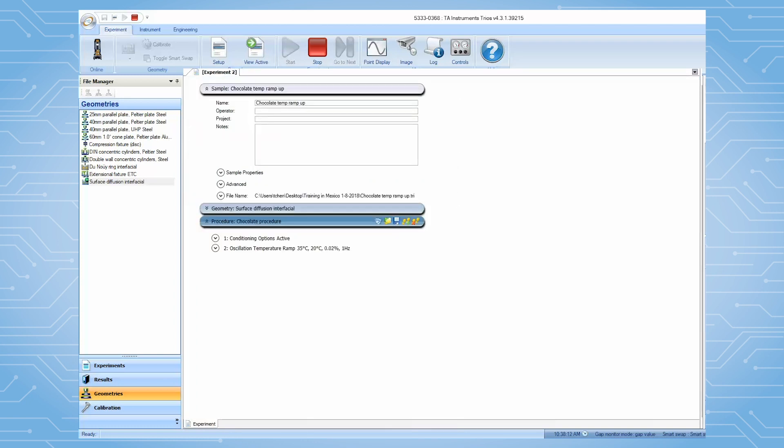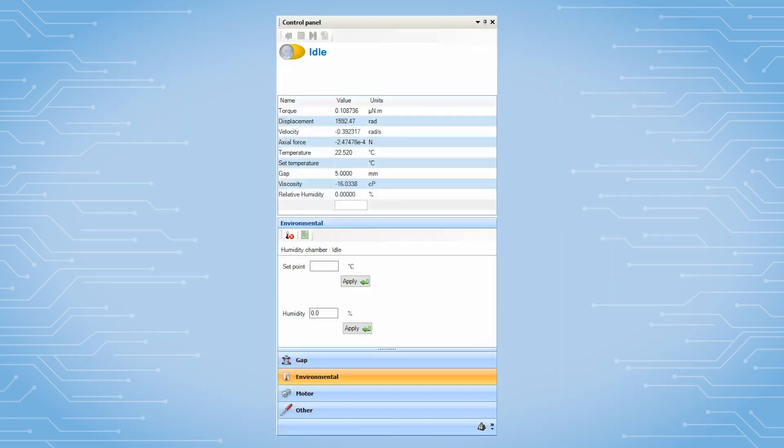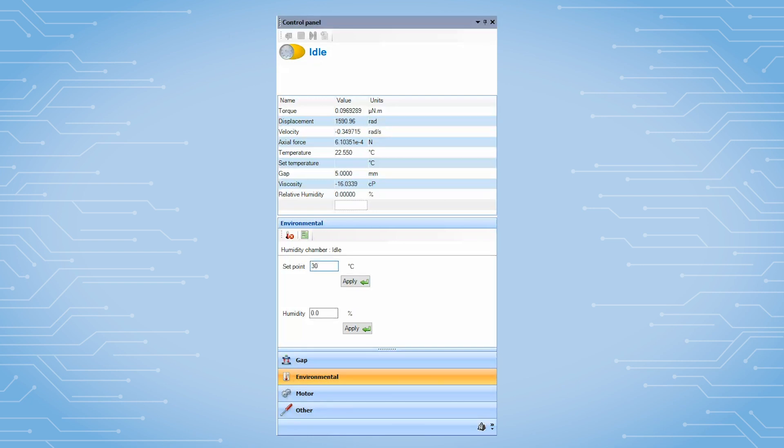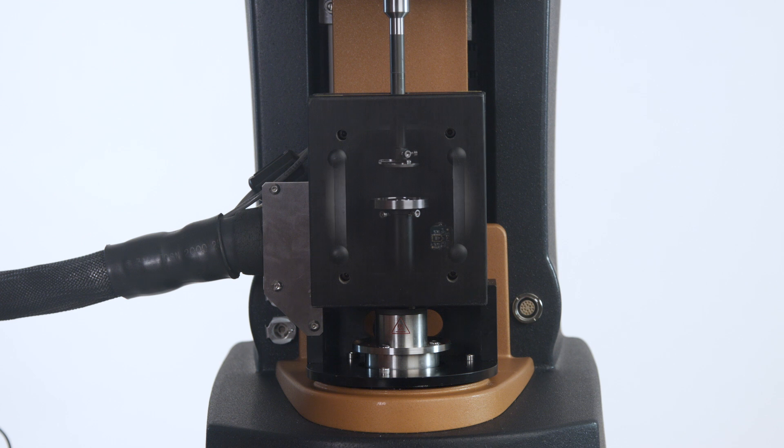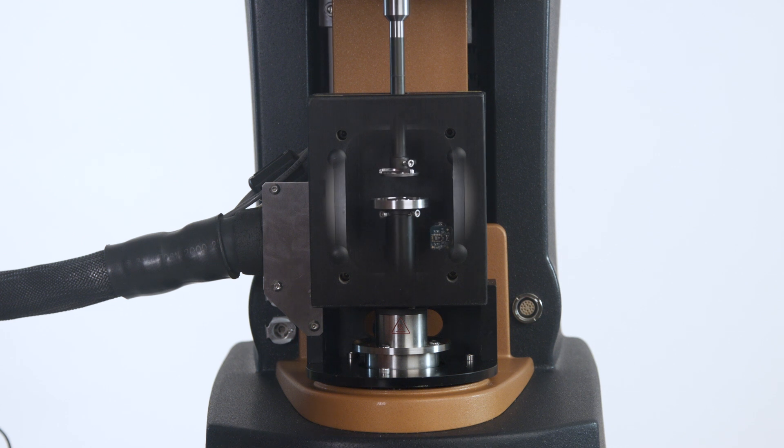The next step is to precondition the chamber and geometry. Under TRIO Control Panel and Environment, set up the initial measurement temperature and humidity. After the chamber is fully equilibrated, zero the geometry gap.